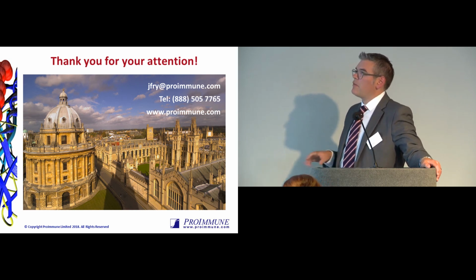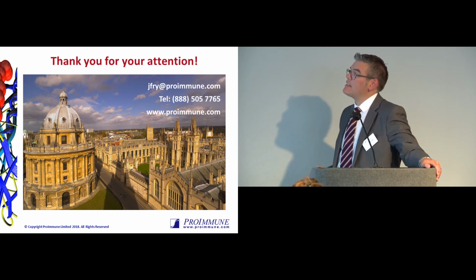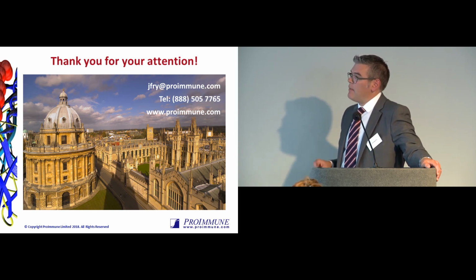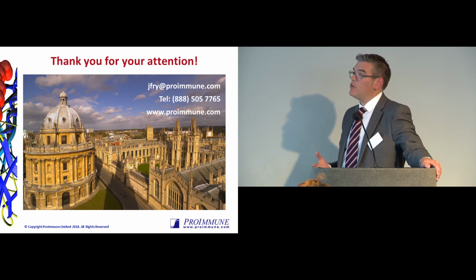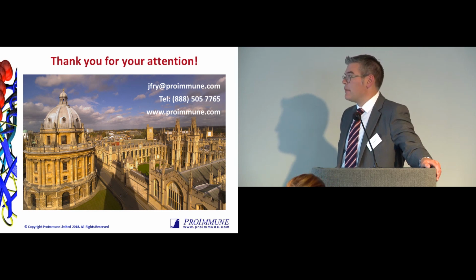I don't think we've done that direct comparison. The CD8 depletion is carried out on the T cell proliferation assays in advance of using the cells in the assay. But we also have done a lot of whole PBMC T cell proliferation assays, particularly when you're using shorter peptides, for example, because then you're focusing on the CD8 T cell responses anyway. We can certainly look at those questions, but that's not been a direct question we've looked at.